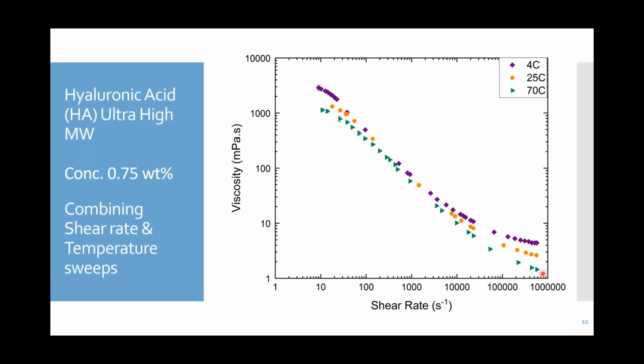I must say that for reaching these high shear rates, we used a 2.5 milliliter syringe and loaded about 1.5 milliliter of sample into the syringe. So it is clear from the results that at all these temperatures, the sample shows highly shear thinning characteristics. And again, to cover a wider range of shear rate, the combination of CO5 and EO5 were used.